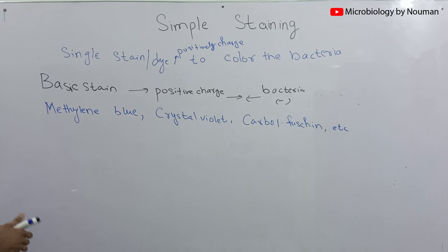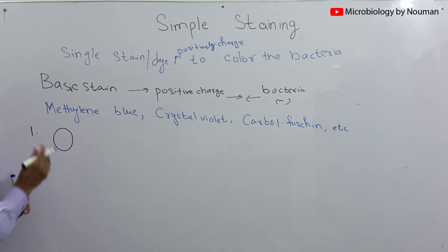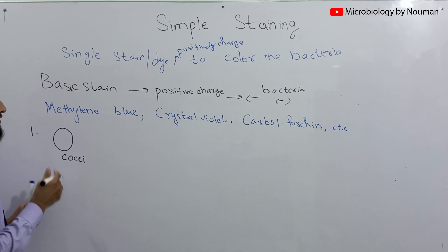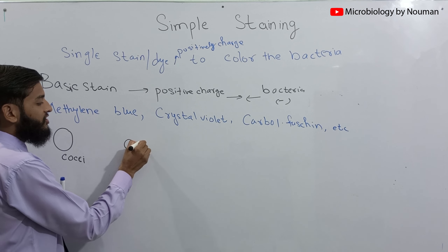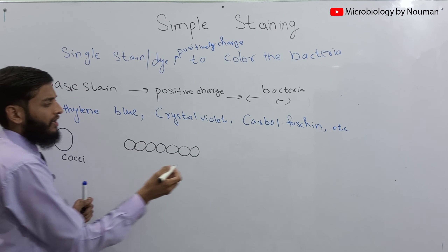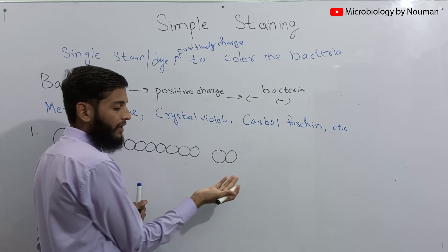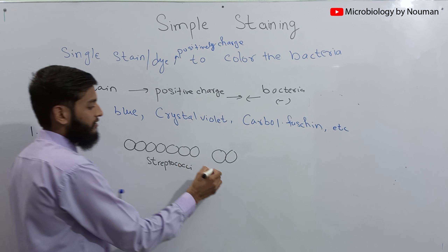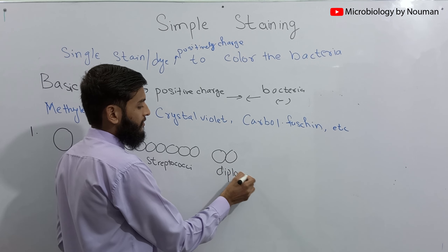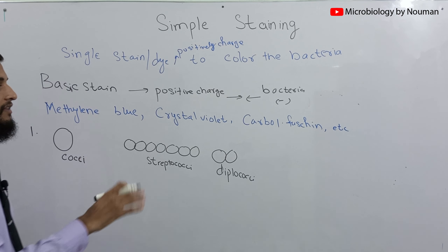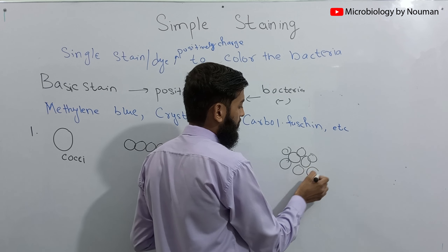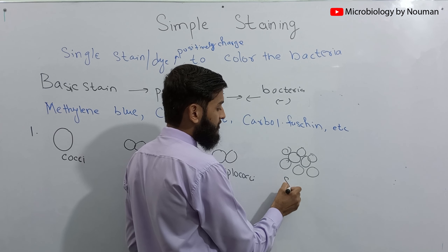We may see round-shaped bacteria that look just like a tennis ball — we call them cocci. These cocci may be arranged in a chain form, called streptococci, or they may appear in pairs, called diplococci. Cocci-shaped bacteria that are arranged irregularly, just like a bunch of grapes, belong to the genus Staphylococci.